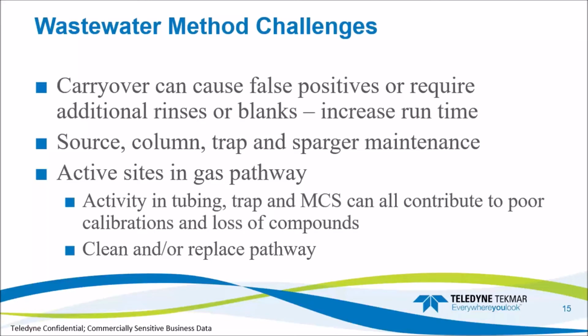So as these start to build up in the gas pathway, the parts of the system that we don't normally consider to be consumables can cause active sites where reactions can occur and can serve as absorbents, where some of the compounds of interest will get stuck or hung up and could be re-released into the next sample or samples after that, or may just disappear altogether and we see a suppression of the actual concentration being passed on to the detector.